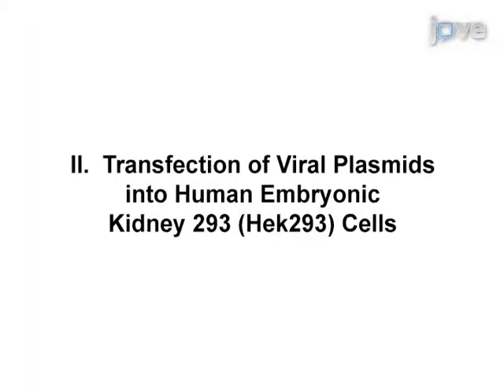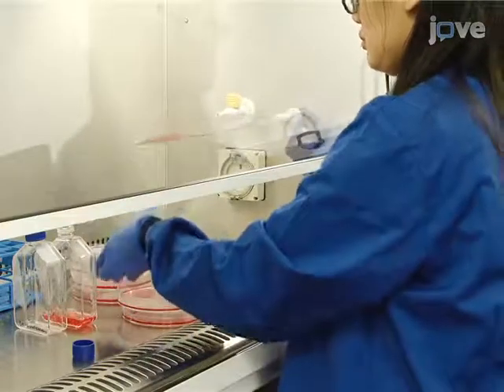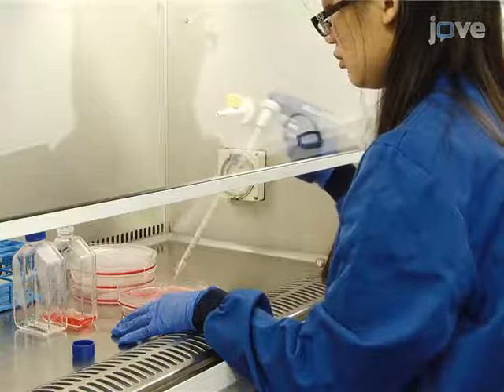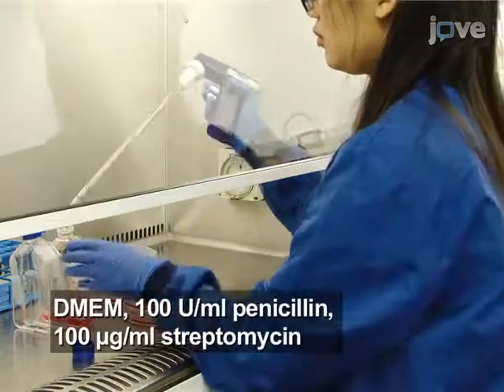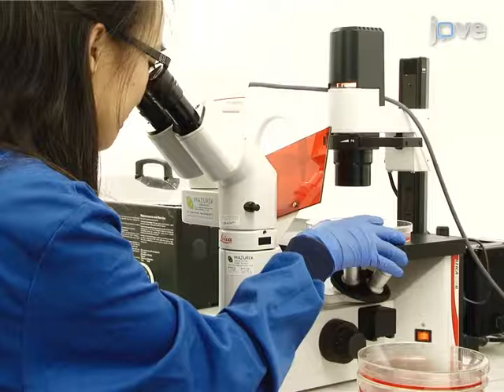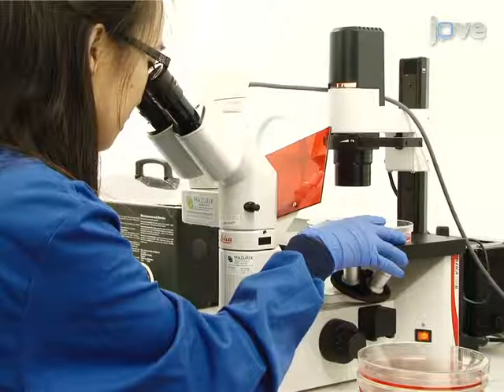Prior to the start of this protocol, prepare high-quality plasmid DNA stocks and screen for integrity as described in the written protocol. To begin, plate two 80% confluent 150cm² flasks of HEK293 cells into five 15cm diameter NUNC tissue culture dishes. Culture cells in standard DMEM with low glucose containing 10% fetal calf serum. Approximately 48 hours after plating, on the day of transfection, cells should be 70–80% confluent.